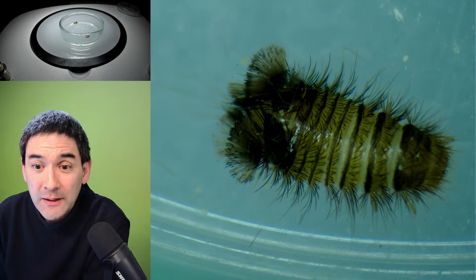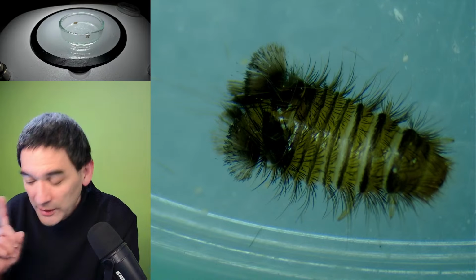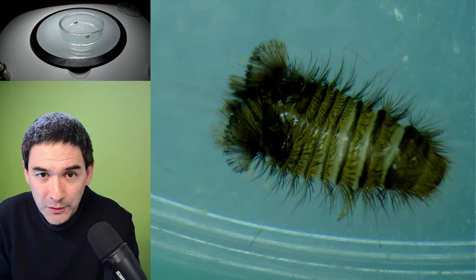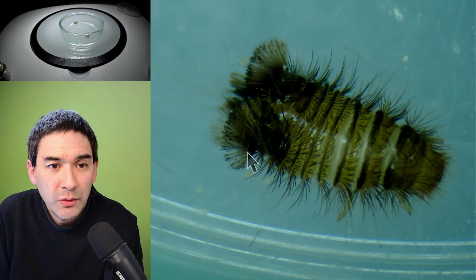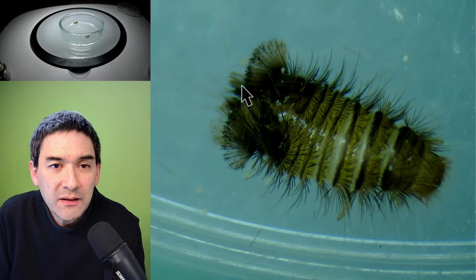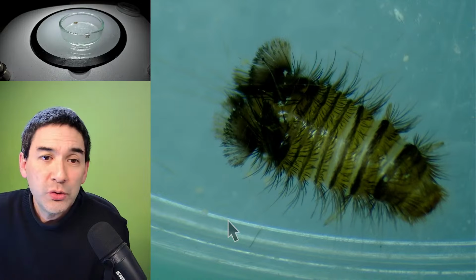You never saw that part move like this. I want to talk a little bit about that because this relates a little bit to the fiber part. You've just seen the back part here. I turn on the arrow. The back part fans out. Something you don't see at this magnification very well is that it looks like tiny little arrows. So I'm going to zoom in.